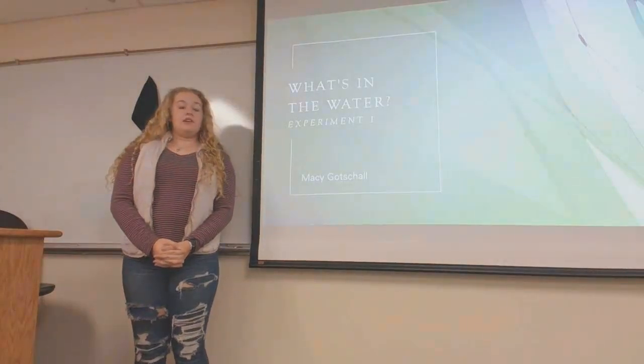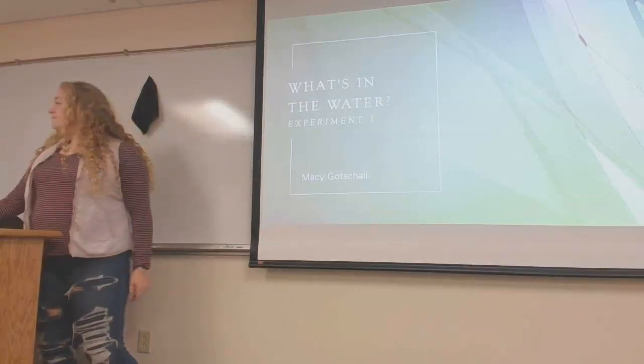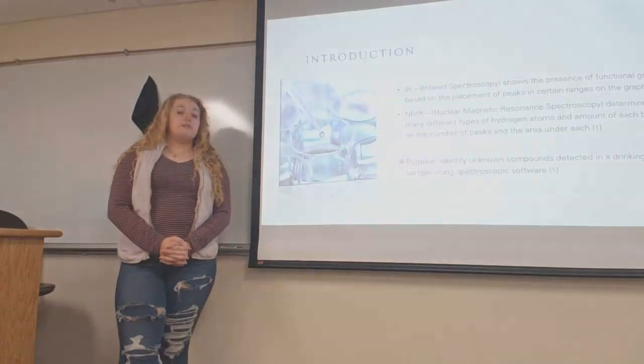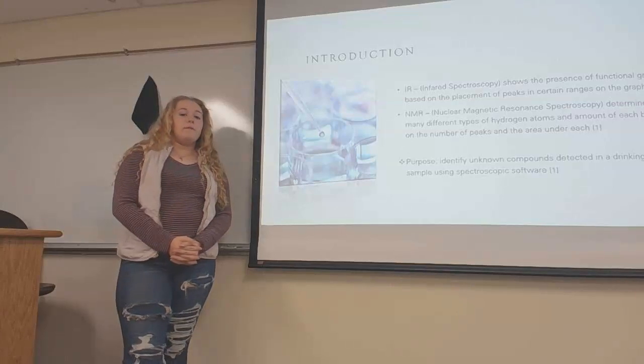My name is Macy Gottschall, and this is my final oral presentation for Experiment 1, which was What's in the Water. The purpose of this experiment was to identify unknown compounds present in a drinking water sample. So to do this, we used IR and NMR spectroscopic software.